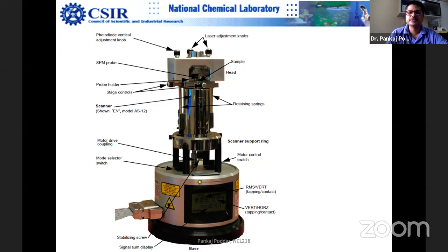You can't do the measurements casually. Many times people do the AFM measurement or STM, they don't know really what they are doing. Most of the physicists obviously know, but I'm talking about non-physicists, they just buy the AFM and don't get the desired results, because the basic training is lacking actually. So hardcore physicists will leave the room locked and will come at night and do the sensitive measurements. And it takes a lot of time to stabilize the electronics.